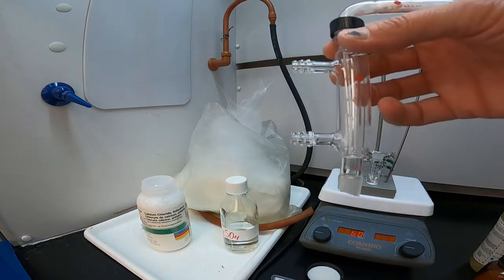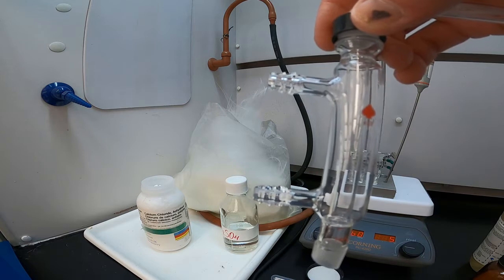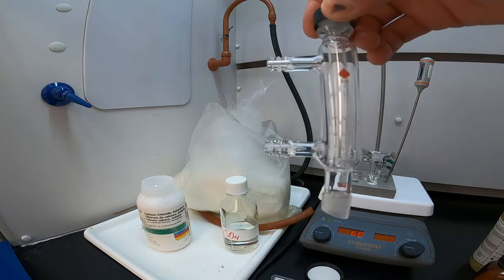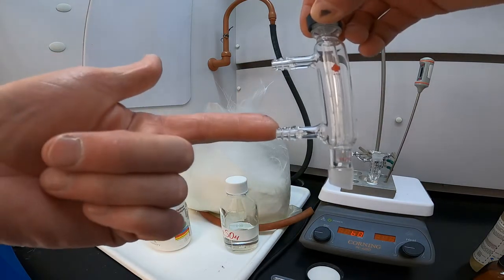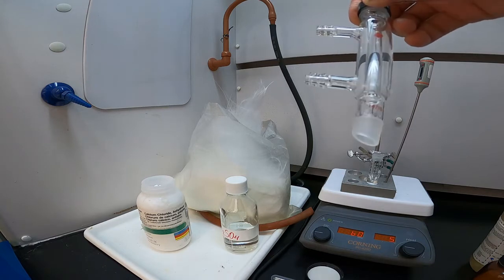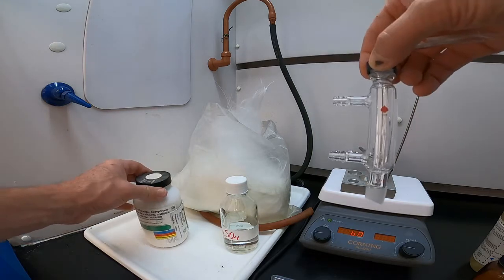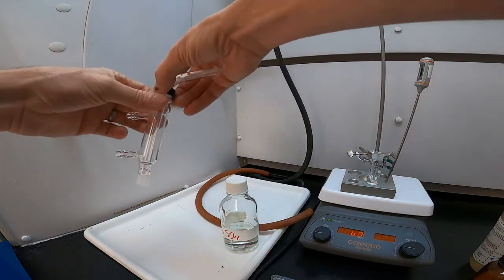The water-jacketed reflux condenser, and if you look at the picture that will show it as well, has a tube on the inside. It's kind of hard to see, I'm sure, in the video, but it has a tube on the inside that allows vapors to go up inside, and then on the outside, the jacketed part allows water to go in one side and out the other side. So that water coming in and circling through that outside of the tube that's on the inside allows the vapors to condense and drip back down into the reaction vial. So as the reaction proceeds, the vapors, the solvent, remain. So I'm going to put that aside for now, and I'll finish setting it up after I add the rest of the reactants.